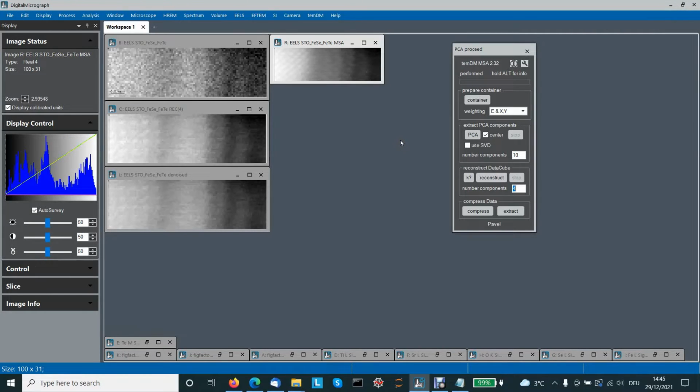This is actually a common belief that PCA is nothing but a kind of denoising tool. However, in my opinion, PCA is not just a denoising tool. PCA is more general. For denoising, we can use much simpler methods. For instance, Gaussian blurring can come to very similar results. Denoising is, of course, a benefit of PCA, but not the most important benefit. More importantly, with PCA, you can understand the internal structure of your data.